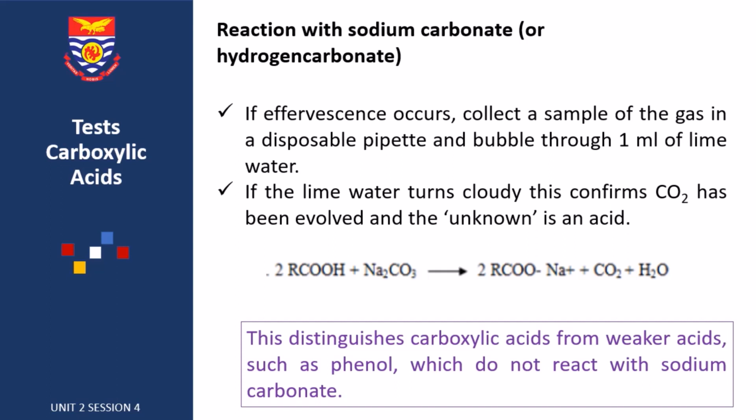Now this effervescence can be collected into a disposable pipette and then bubbled through 1 ml of lime water. So if you bubble this through lime water and it turns cloudy, that confirms the presence of carbon dioxide, right?